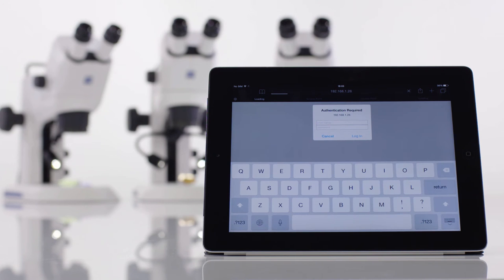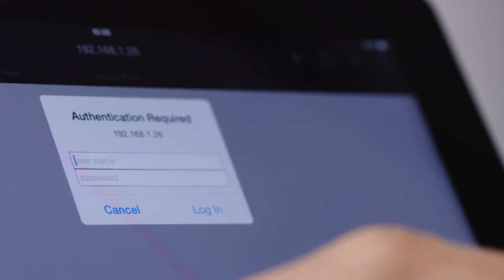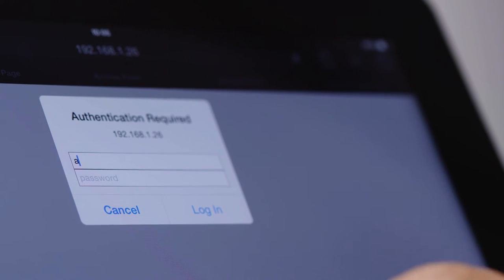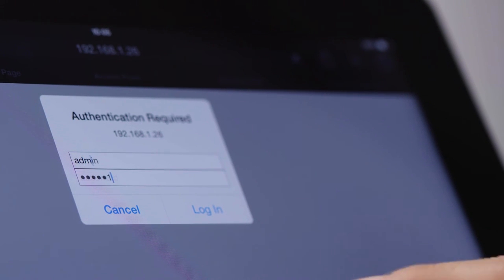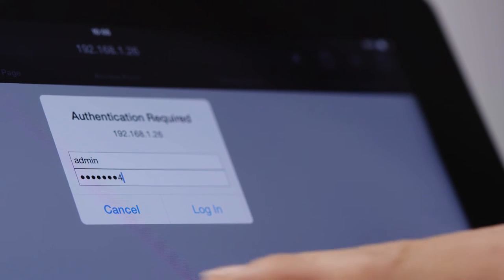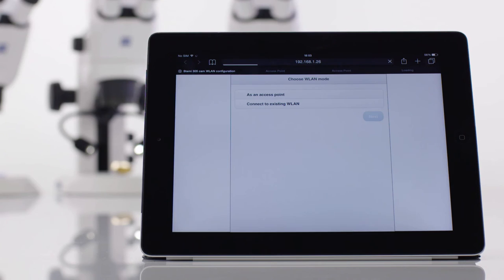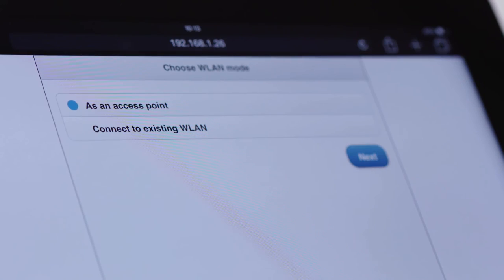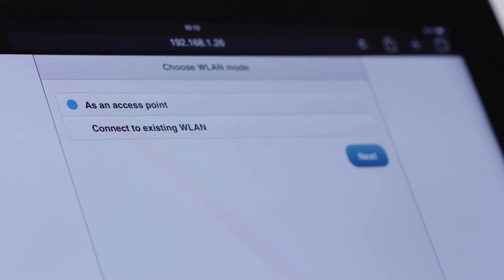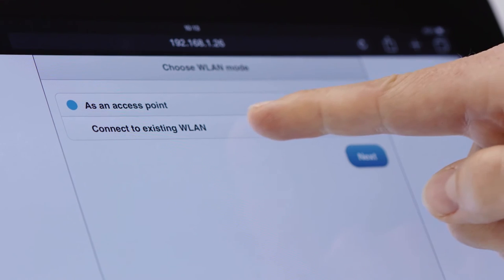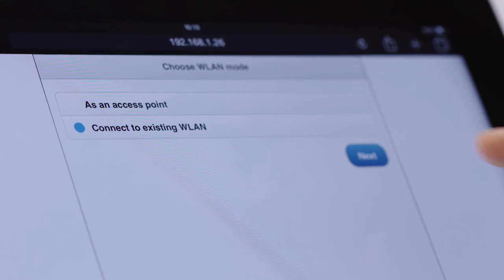This is protected with the username and password shown in the app. Once you're logged in, switch the Wi-Fi mode to 'Connect to existing Wi-Fi' and press Next.